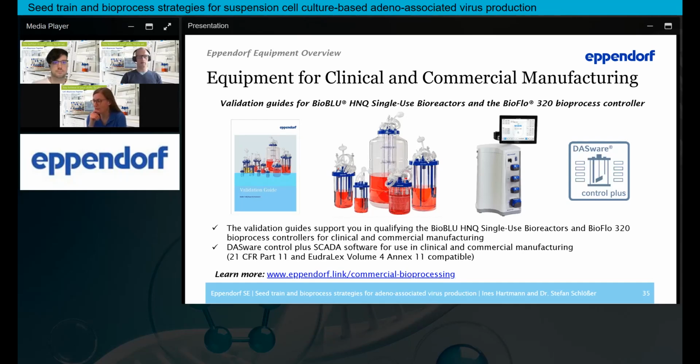So it's a little bit more popular, the non-baffled. But if, for instance, you work with bacteria and yeast, which grow very quickly and consume a lot of oxygen, to use baffled flasks is very common, very handy, especially if you want to increase the volume, so you can get more oxygen in the culture broth. But for mammalian cells, it's good to start with non-baffled.